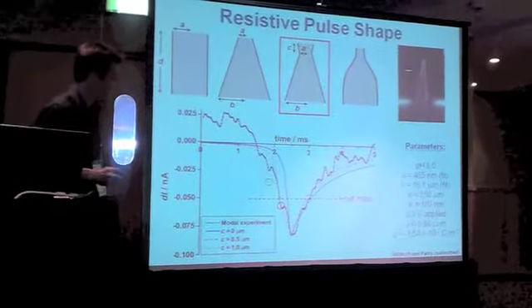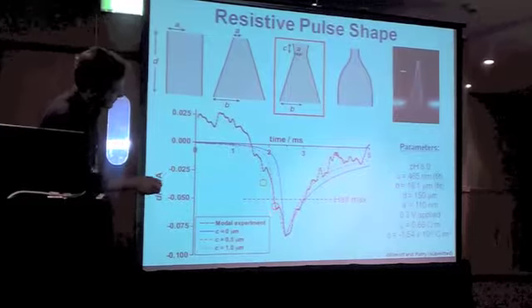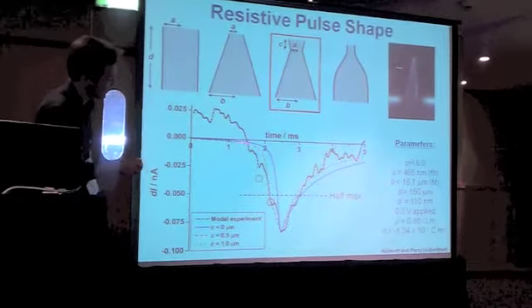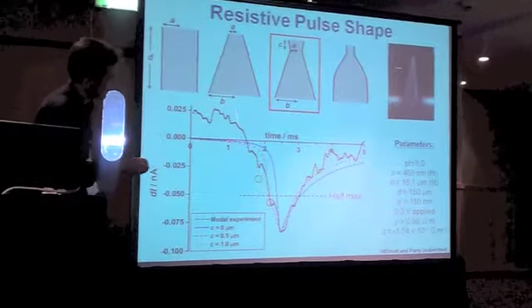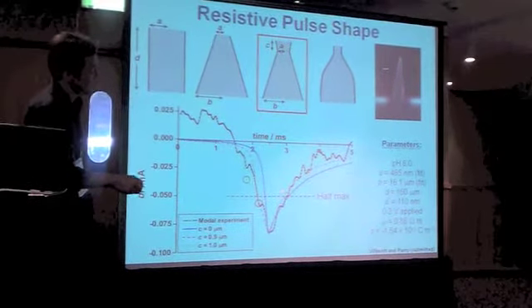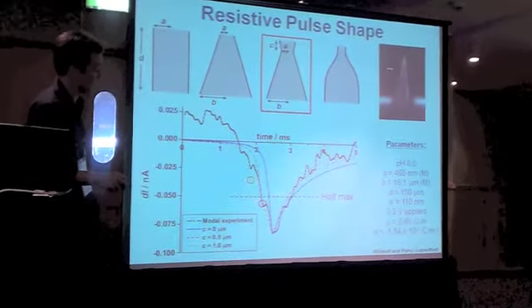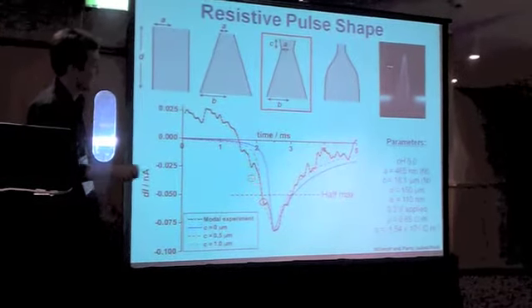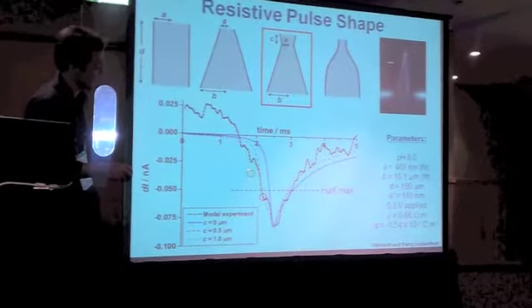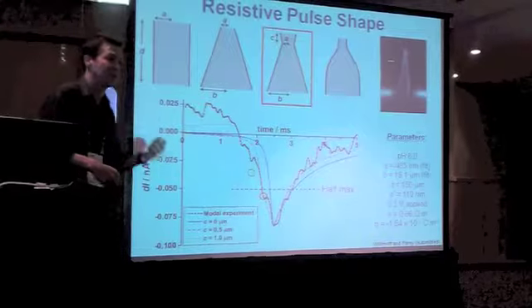And you'll see here we get much better reproduction of the asymmetry of the shape in the red and the green traces. The blue is just the conical pore. The red and the green are much closer to the shape. Full width at half maximum is in reasonable agreement, but you still have some issues, for example where the green and red circles are the kinks where the particle enters the top pore. Depending on whether they lie on either side of the half maximum, you're going to get quite a different pore width measurement.